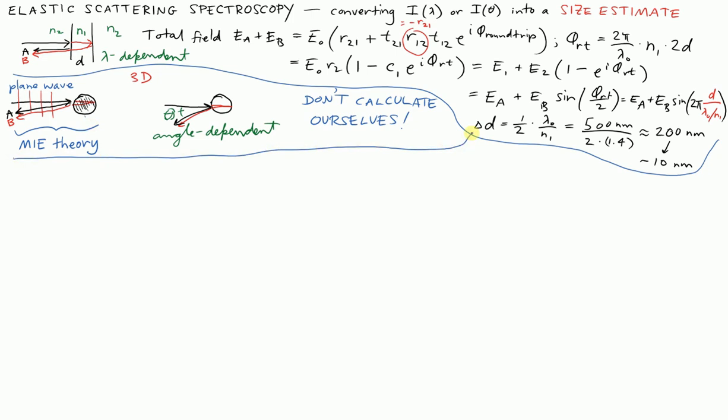The first thing we have to think about is if we have a thin sample. So with thin samples, the measurement geometry can be relatively straightforward. You would have a sample like a little cell like this that you might want to study, and you might place it in the path of a plane wave, as I said.